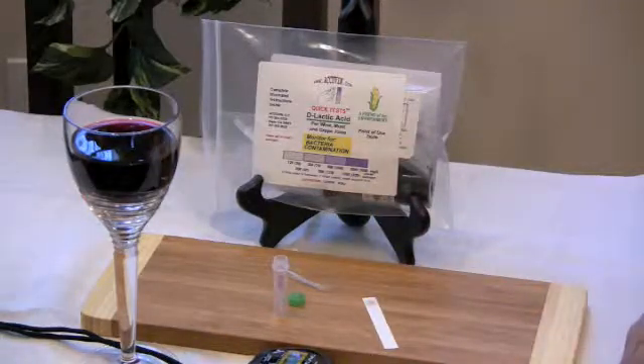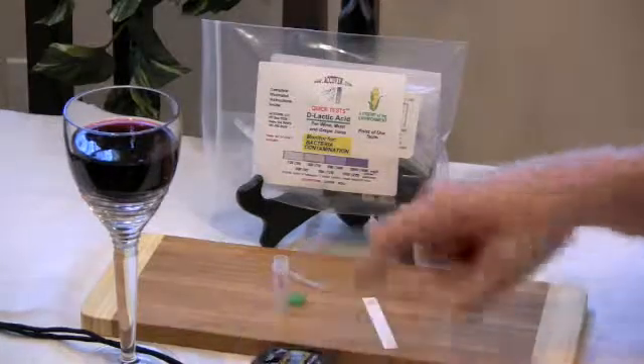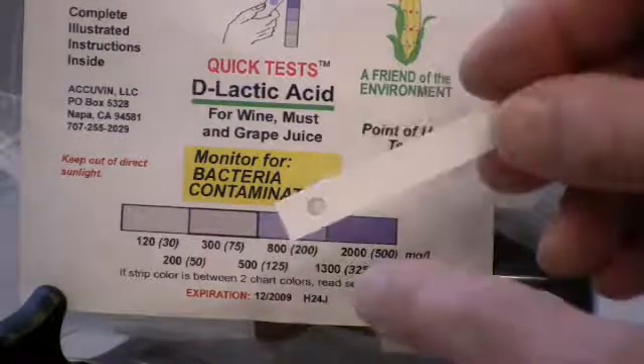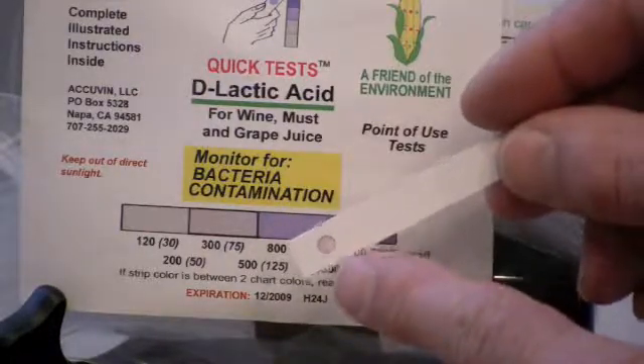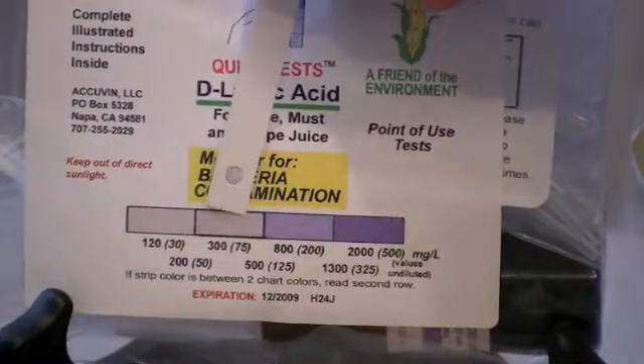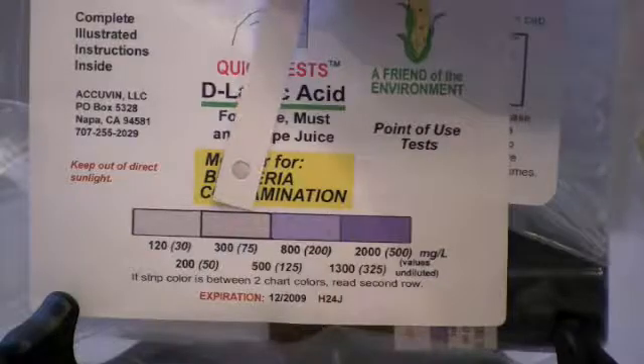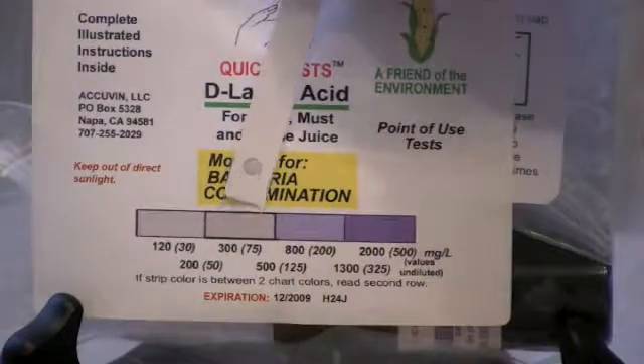The test takes 4 minutes. We'll start the timer. Time's up. We'll match the color in the round circle to the color chart. The color of this wine corresponds to 300 milligrams per liter.